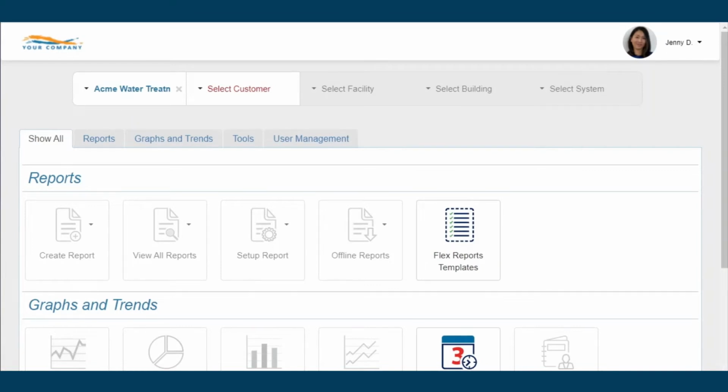Users with access to the customer account as well as access to view reports will be able to view all reports saved within the system. Reports saved within the same system will be stored together. All test results saved within the system can be trended together.